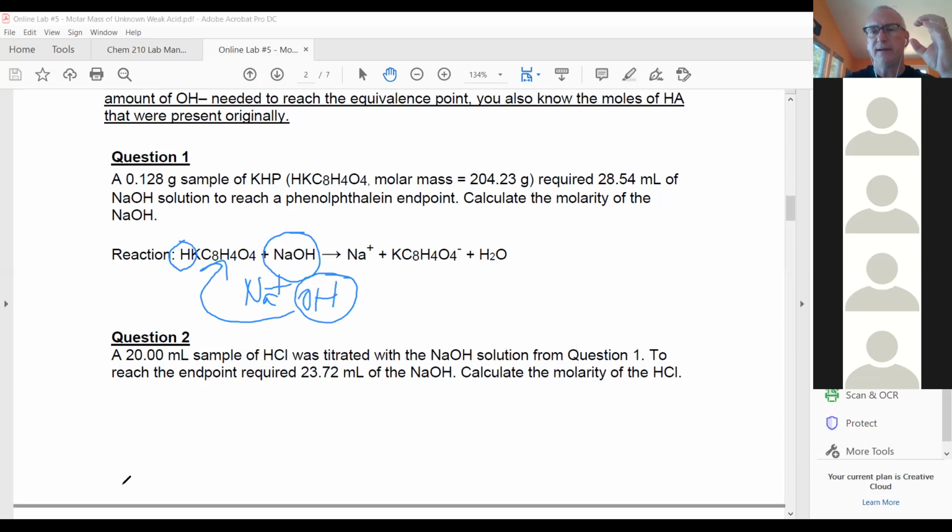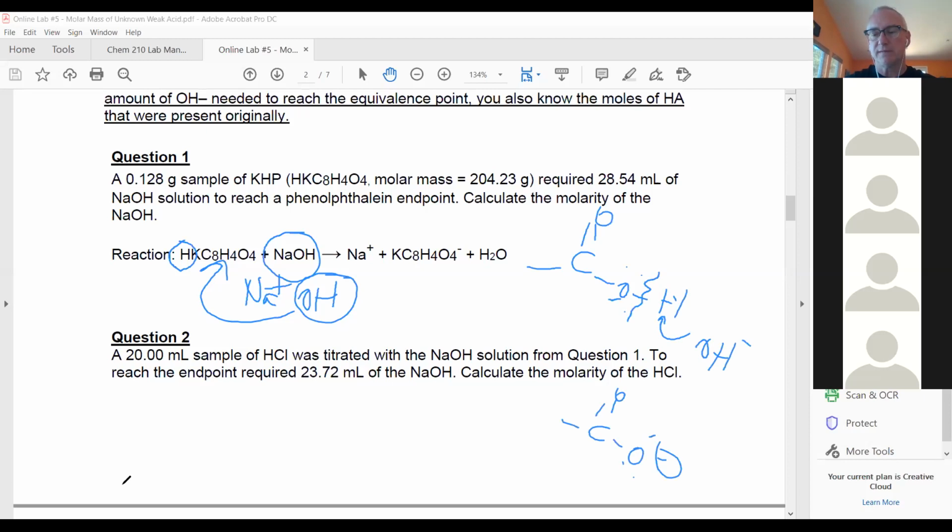That's basically what a weak acid is. It means it's holding on to a hydrogen with a very weak bond that's easy to break. And classically, this is what most organic acids look like. So here's oxygen, and it's holding on to this hydrogen. But this particular bond is very weak, and so it breaks easily. If you have something like hydroxide come by, it can actually pull that off and leave you with this. Now the oxygen has a negative charge on it and water is produced. So that's the reaction that's taking place. Strong base pulls that hydrogen off, leaves you with a negatively charged anion and water.